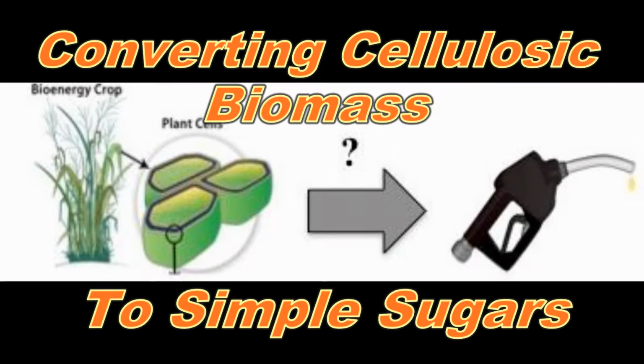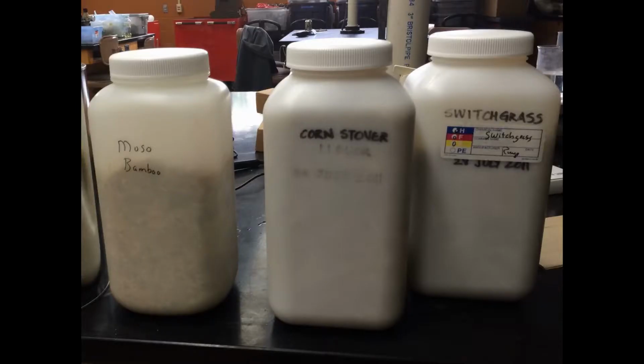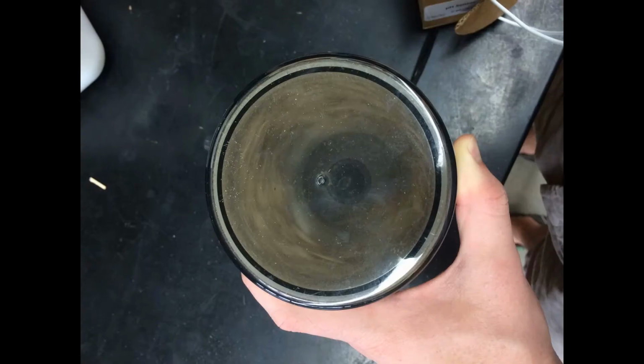or chemicals. First, choose 2 to 3 biomass samples and decide on a cutting or grinding treatment and a time you will grind each sample of biomass for. Write down an initial claim based on your current knowledge and available evidence. What do you expect to happen in this experiment?